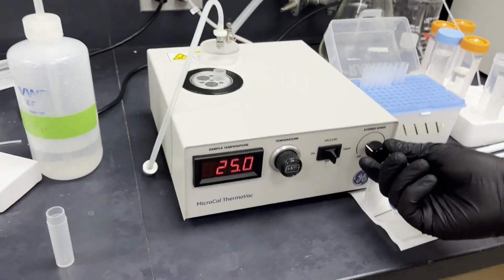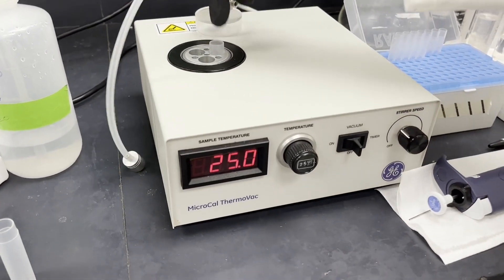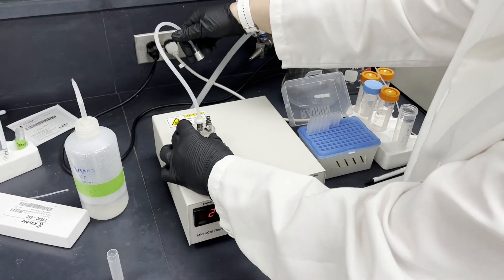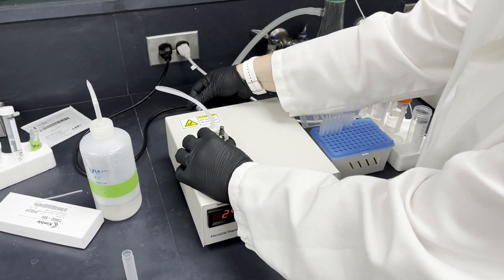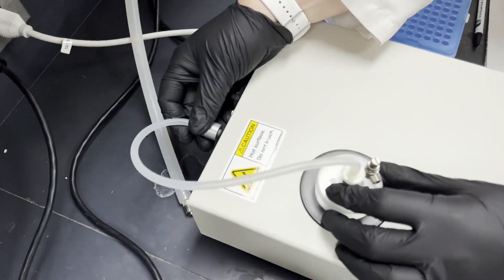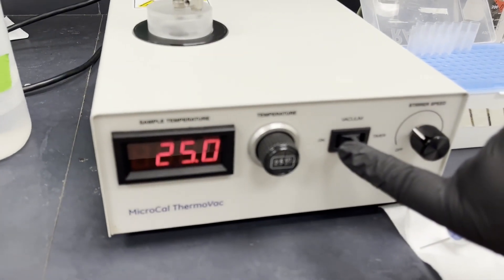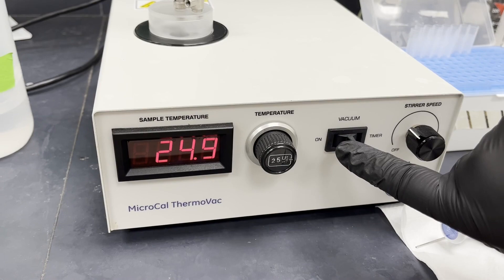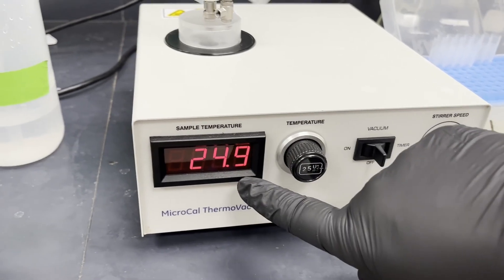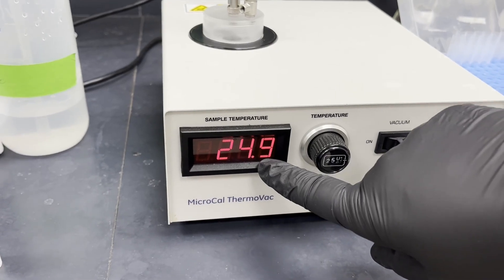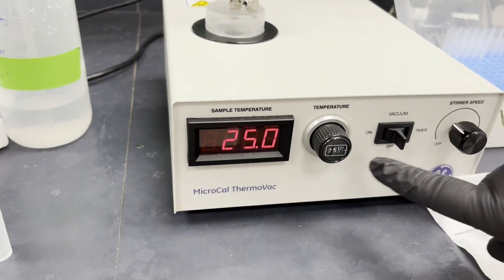This has a stirring speed which you can adjust, so it's actually stirring in there. In addition to stirring you can attach this in the back and then flick the switch over to the timer and it will degas for five minutes. Also, if you're running your samples at a lower temperature or a higher temperature, you can pre-equilibrate your samples to the desired temperature.